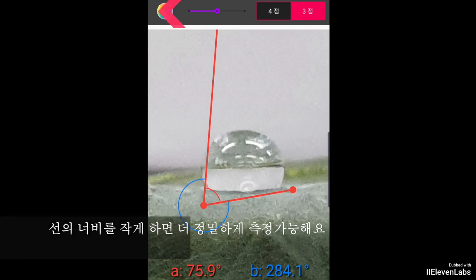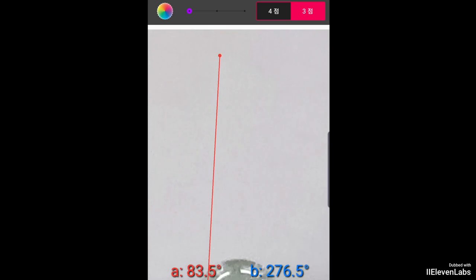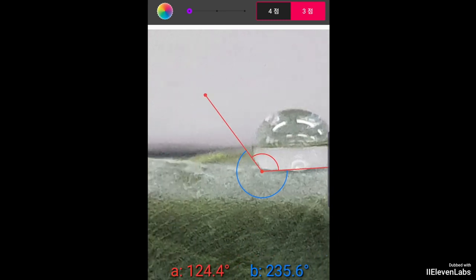The contact angle forms where the water droplet, air, and plant surface meet. To measure it, students should carefully adjust the line to touch the edge of the water droplet where it meets the surface to create a good tangent line at the interface of water, air, and the plant surface.